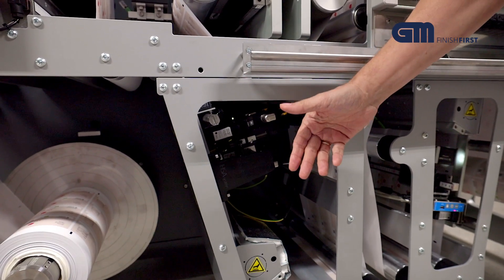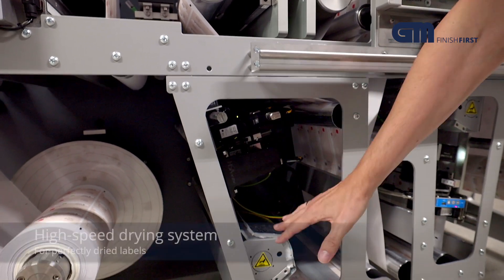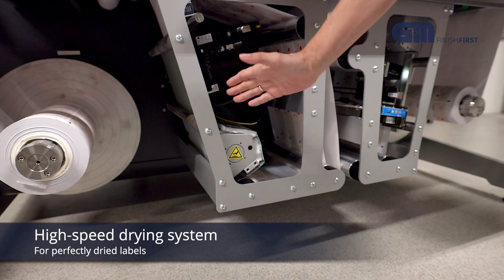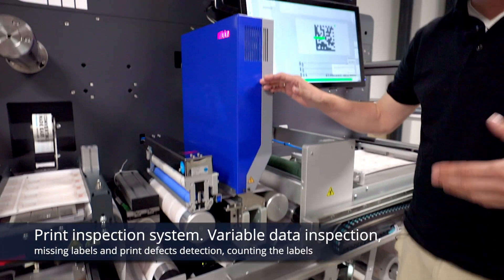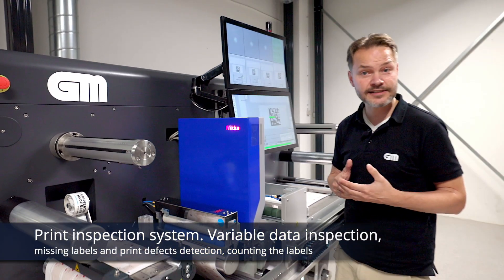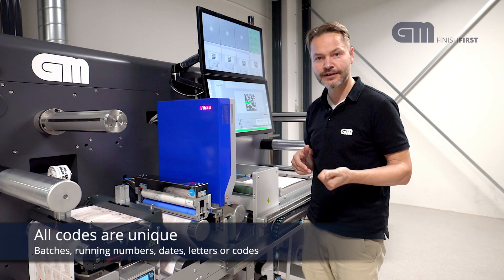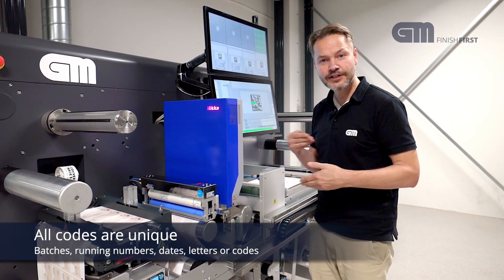We can fit more heads if needed, but this is a typical setup. After the printing, there is a drying system here allowing for a high process speed, so the actual printed codes will be perfectly clear and not smear out. Then we move up to the inspection. Now we have printed the QR code, and remember, this is a digital system — all the codes can be different. They are not the same. It can be a running number for a batch, or it can also be a date. So every code is different.